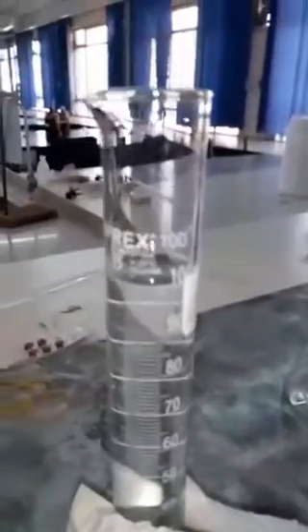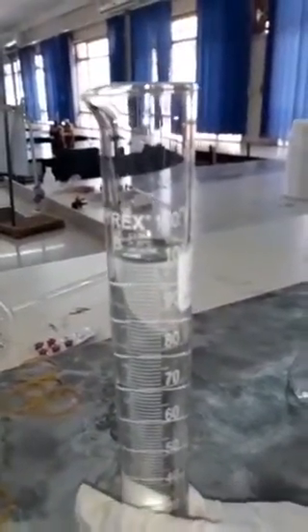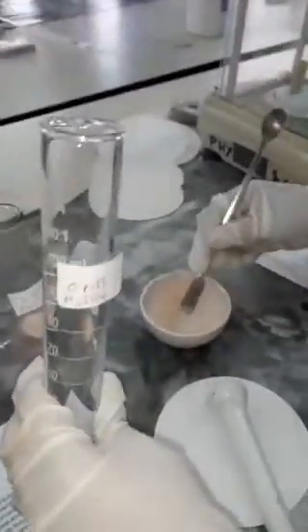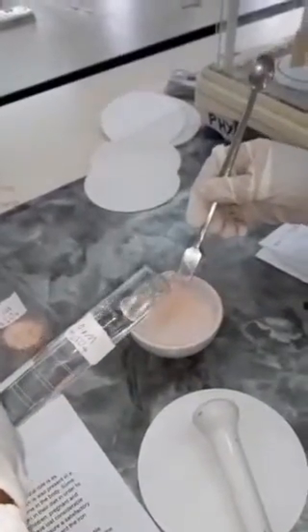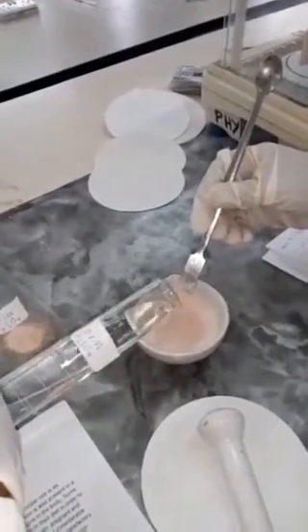So you transfer everything, and then we're going to dissolve the powder using 0.1 molar sulfuric acid. We're going to use 100 mL. This is the 100 mL, which I've already measured in a measuring cylinder. So since we remained with some powder, we'll first of all use some to dissolve the powder that remained in the mortar.